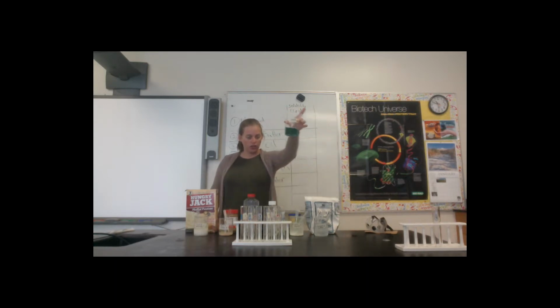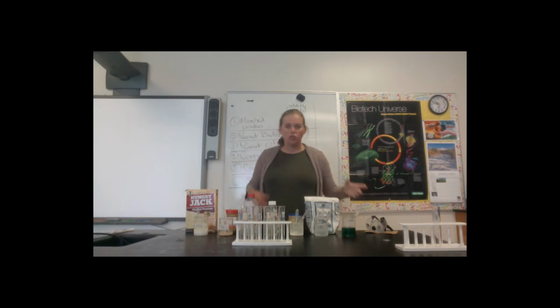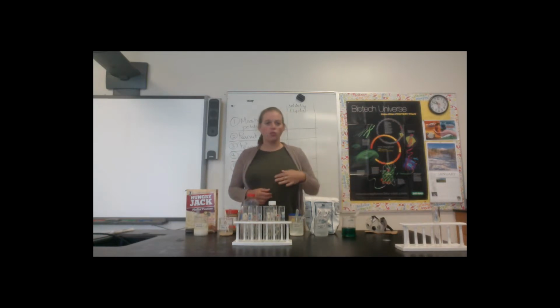And you'll see that I've colored it green to help us see it better. So what it means to be soluble is that one material will dissolve in another. So we are going to be using water to see if these different foods will dissolve in that water. If they do not, if the food is insoluble, then it will form layers with that water, and that will indicate that we have lipids present.